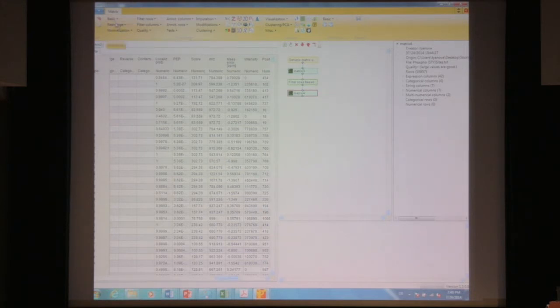Slow down, sorry. Okay, yep, no problems. All right, sorry, it's filter rows and filter rows based on... all right, great. So the next step is just to filter out.